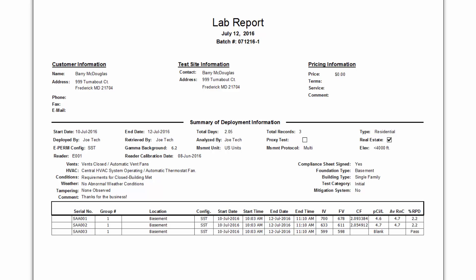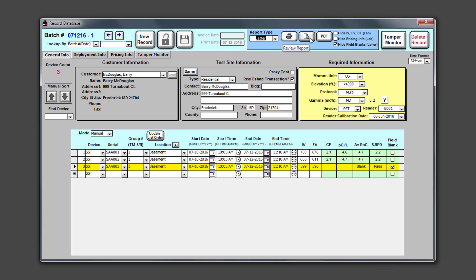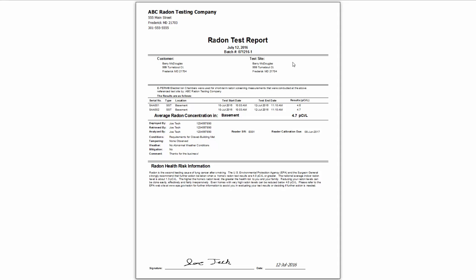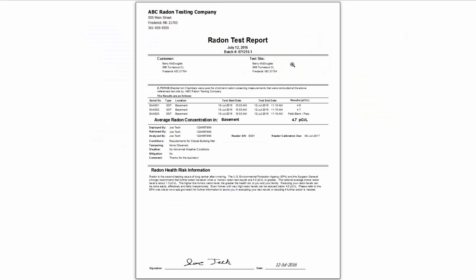There is one more report type we can look at: the customer letter. As this is the report normally meant to be read by customers, the addition of a field blank can be a bit needlessly confusing here. By default, any field blanks will be hidden on the customer letter. Even though the blank is attached to the record, it won't show up. However, if you'd like the field blanks to appear, then unselect the hide field blanks checkbox, and when we preview the report this time, you will see the blank appear on the customer letter. The decision is yours on whether or not to display the field blank on the customer letter; by default, the option is set to hide it.